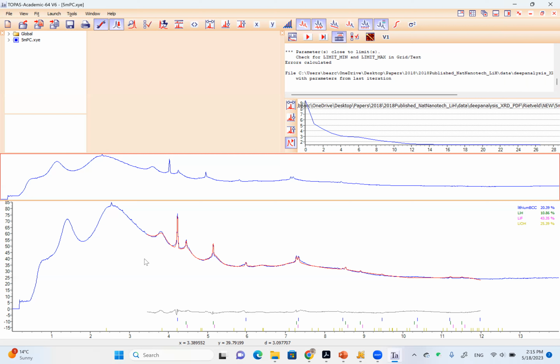And that has a significance on our data analysis. We do not want to deal with this amorphous part, because it's very difficult to find a polynomial to fit these two things, right?